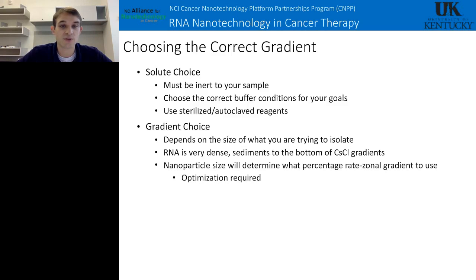You need to choose the correct buffer conditions. For example, RNA, like I discussed earlier, is susceptible to degradation by RNases, the nucleases. However, these nucleases are divalent metal ion dependent. So whenever we do this, we do this in TE buffer, a buffer that contains EDTA, so it will chelate these divalent metal ions and prevent the degradation of your RNA.